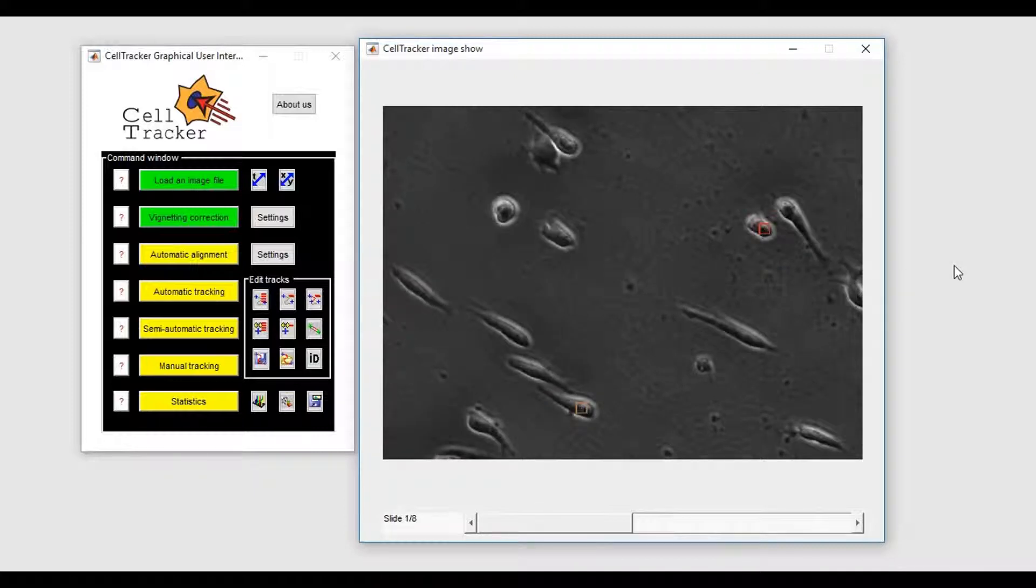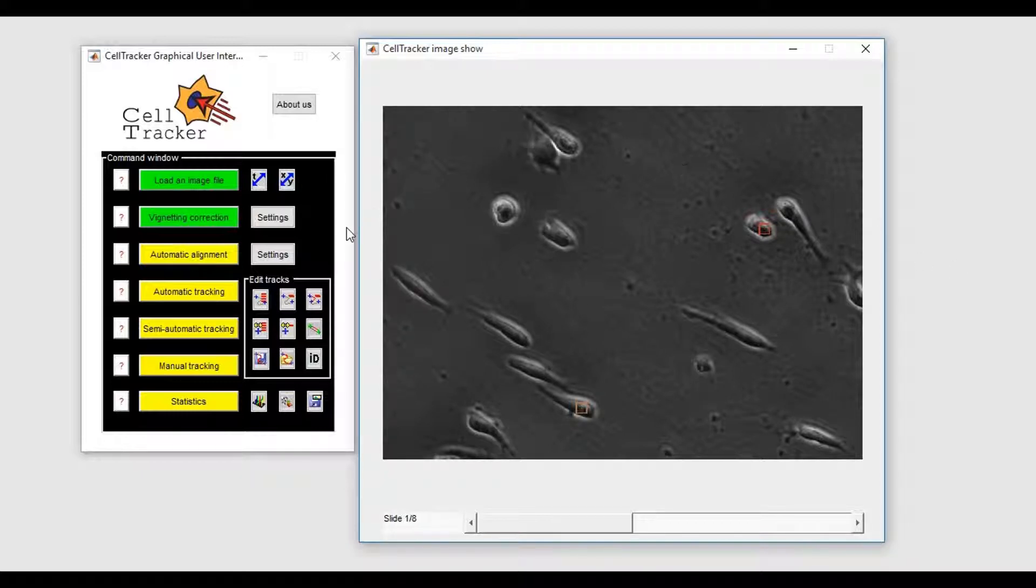Finally, we have also implemented a manual tracking modality to allow the user to precisely define the position of the cells in every frame.